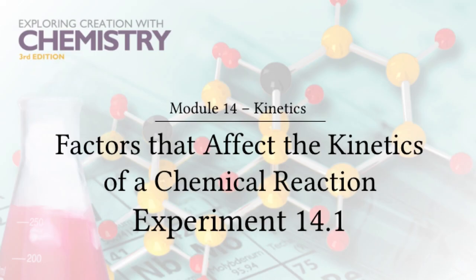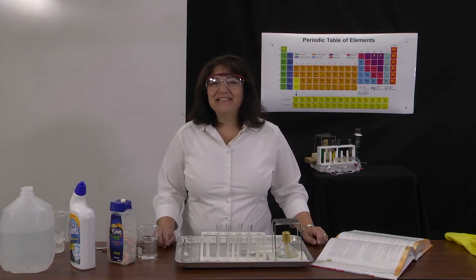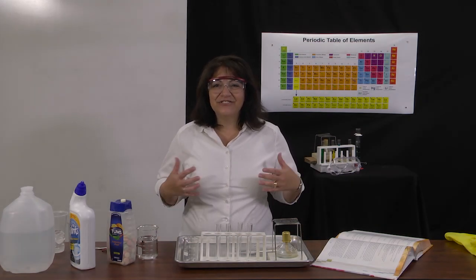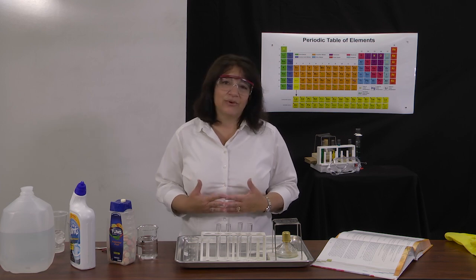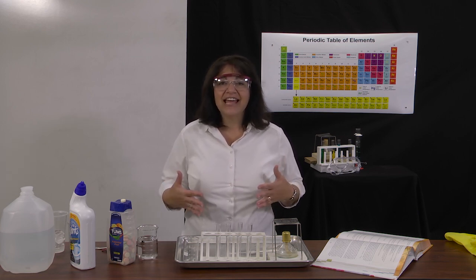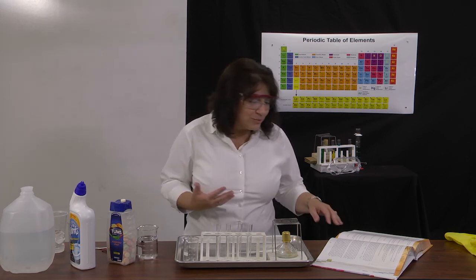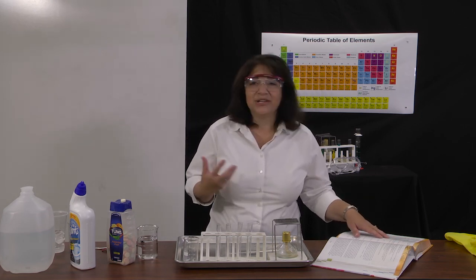Module 14, Kinetics. Factors that affect the kinetics of a chemical reaction. Experiment 14.1. This experiment is going to help you to see the effect of different parameters on the rate of a reaction. So we're going to run a chemical reaction under 4 different conditions and see how those conditions affect reaction rate. One will be concentration and temperature as well.